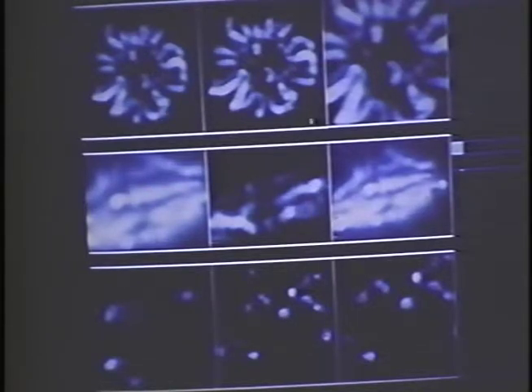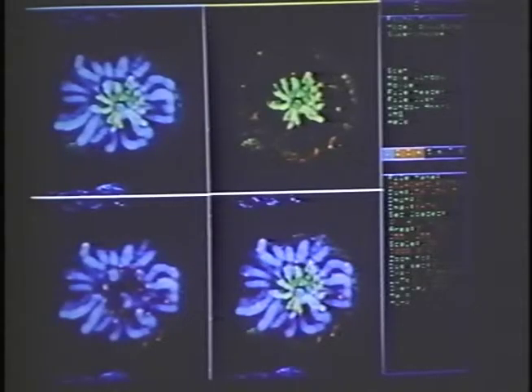Also, behind each window can be, essentially metaphorically, a whole stack of images. So for example, one thing that is very useful for electron microscopy is to show a stereo pair of only a narrow region in the specimen. And then as you advance and back up, you move through space, moving that stereo pair forward and backwards. All of these things we feel are necessary to try to understand and be able to trace and analyze the complexities of 3-dimensional biological specimens.